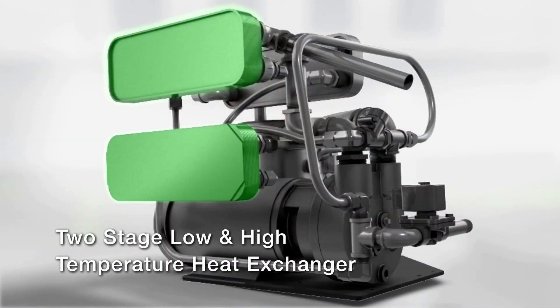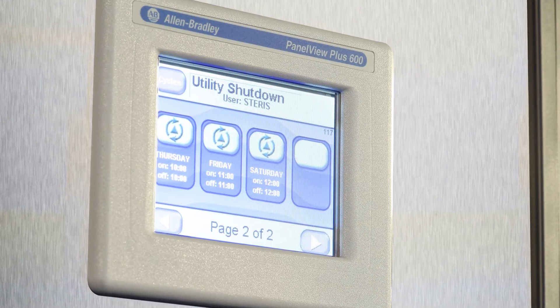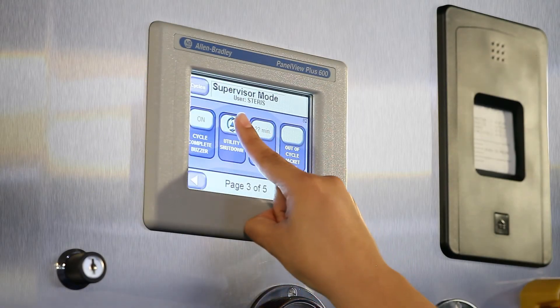Finally, the AMSCO small LS series can be programmed to automatically start up in the morning and shut down at night for every day of the week. To save additional energy and water, the Green Mode allows you to program automatic steam jacket shutdown during slow times of the day.